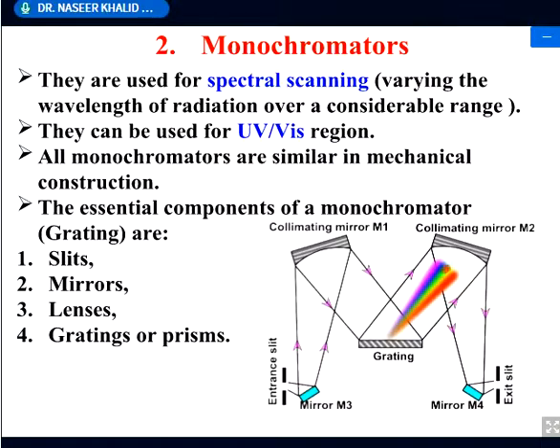If we are in between the green, it will be anchored in such a way that only green will be reaching here, and it will be exiting into the sample compartment. So this is a simple manufacturing of the monochromatic. It is consistent. For example, this is slit. This is mirror. There are the lenses. All these are in order to create light as monochromatic as we can.